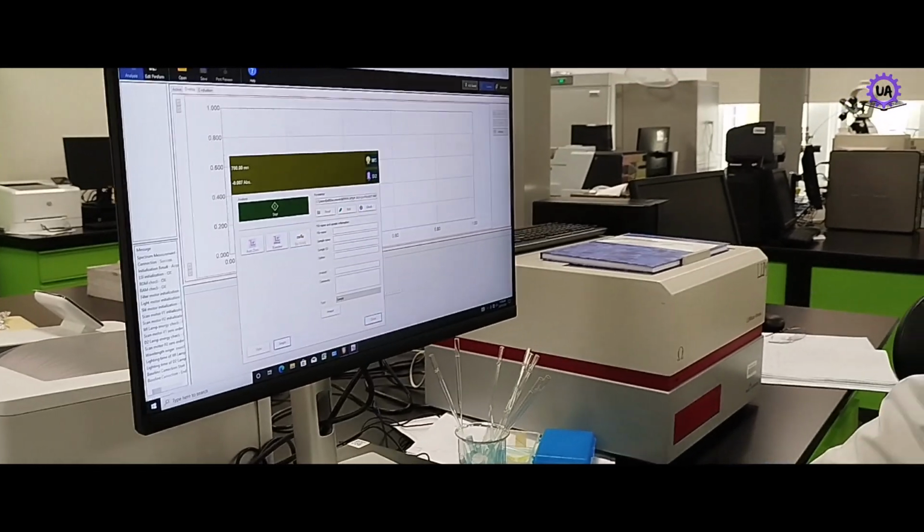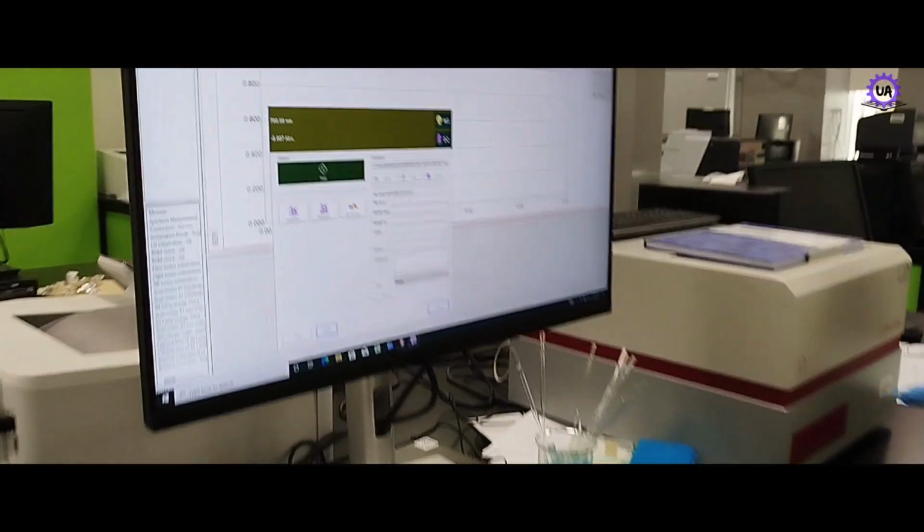You can put the sample in it. This is control.